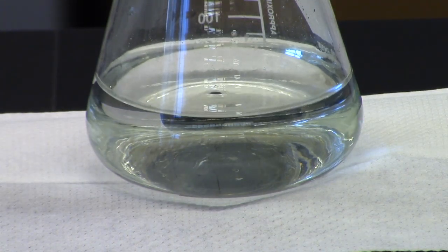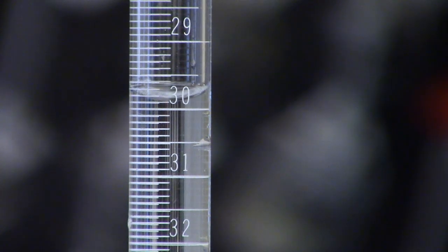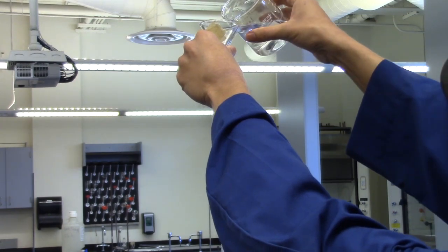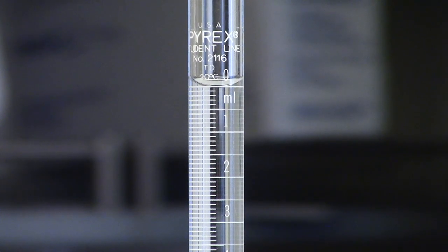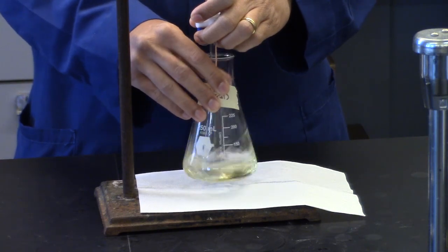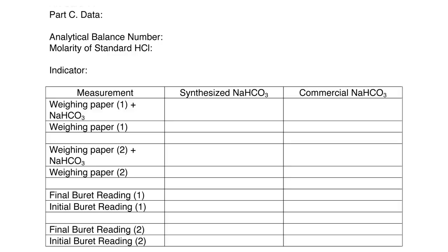Titrate to the appropriate color endpoint. Record the final burette reading. Refill burette with standard hydrochloric acid and record the initial burette reading and start second sample. Repeat for the remaining two samples. Your data should look like this.